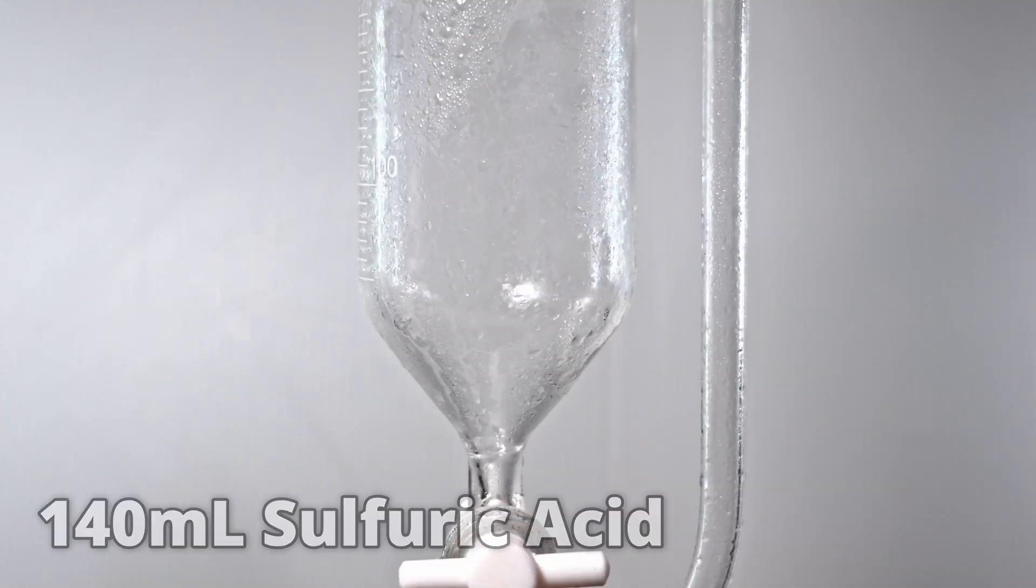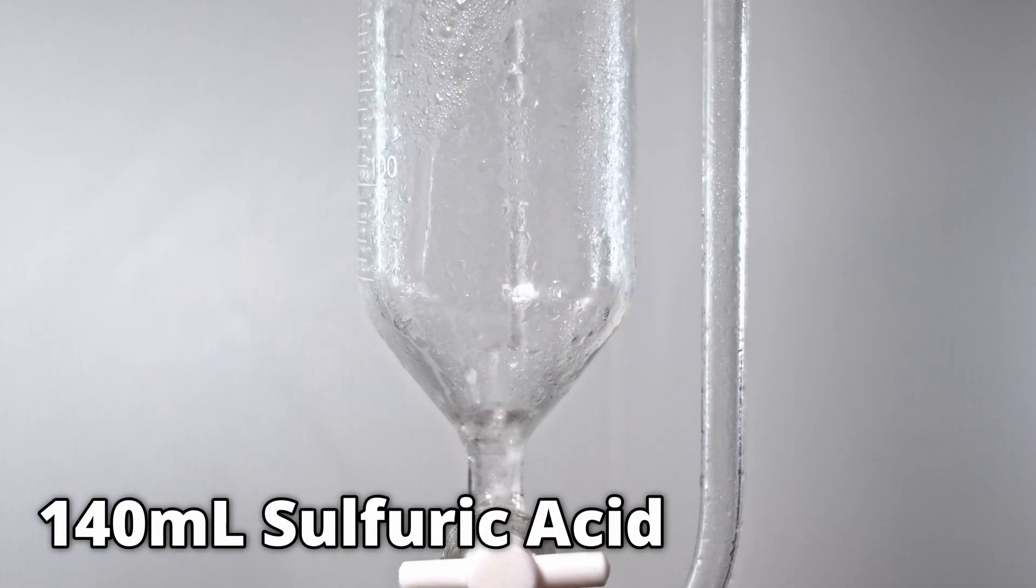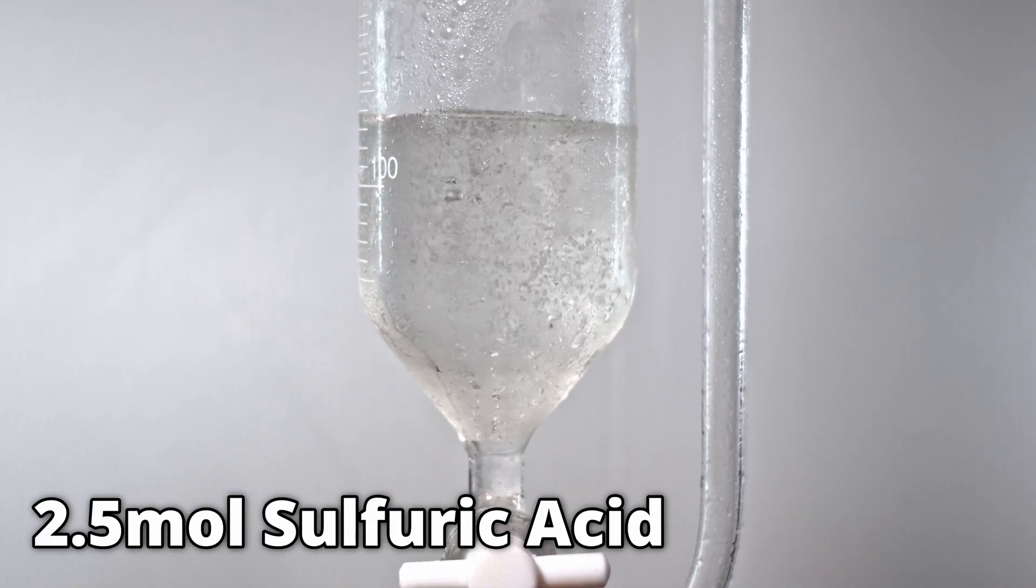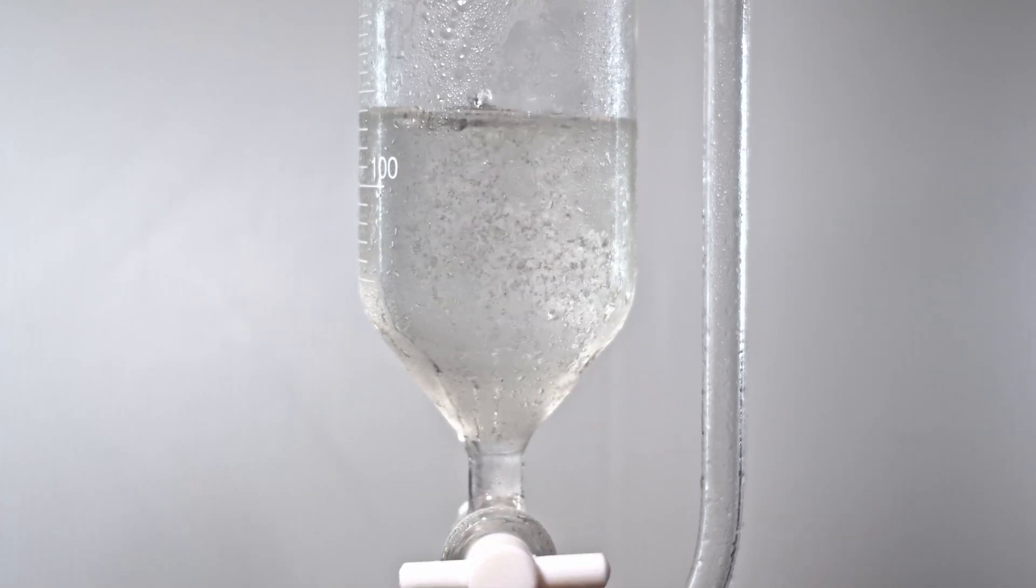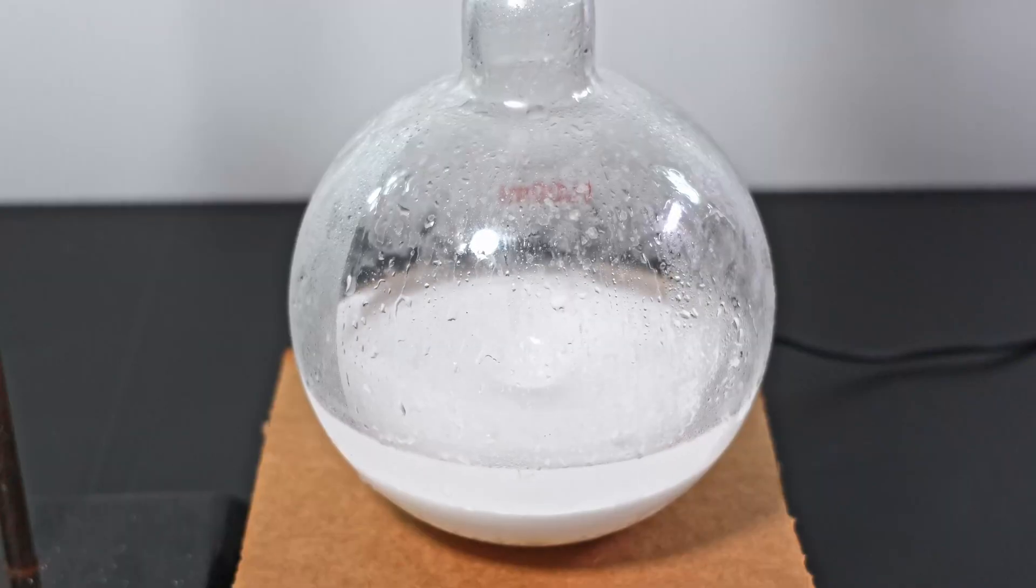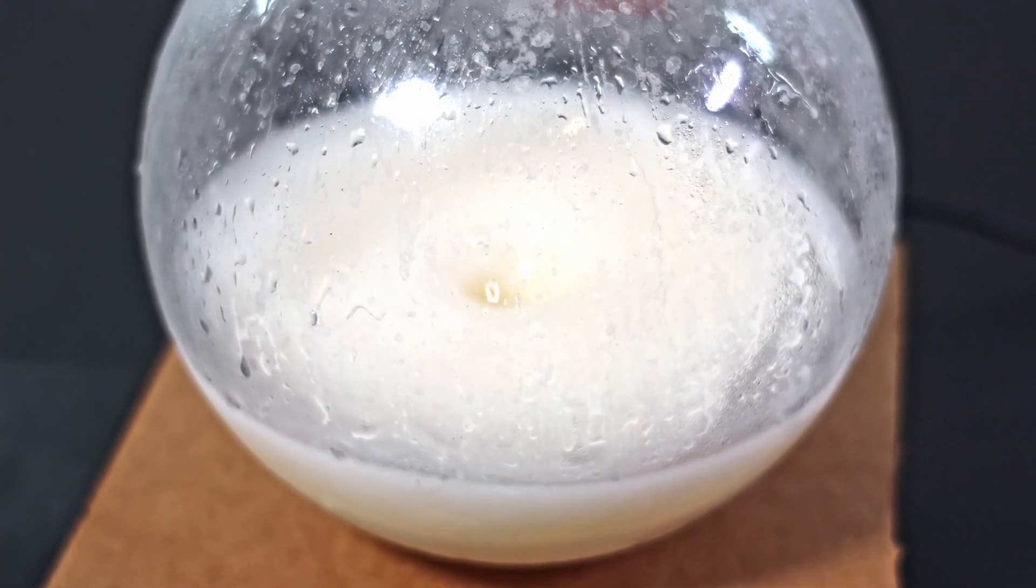In the addition funnel, I pour in 140 milliliters of 94% sulfuric acid. This is approximately 2.5 moles of sulfuric acid. In hindsight though, I probably should have used a 70 to 80% concentration. I slowly drip it in while stirring on high. This minimizes localized superheating and bromide oxidation.